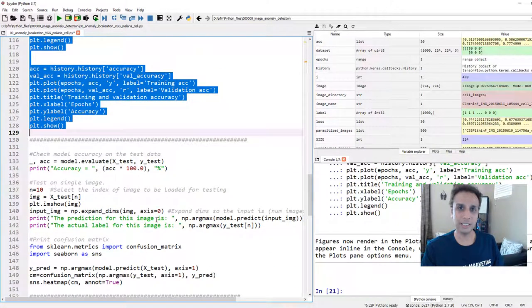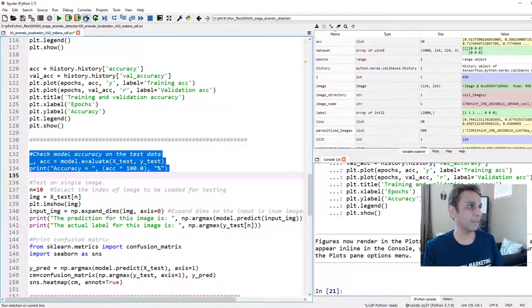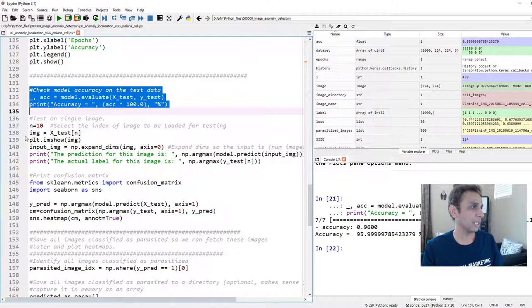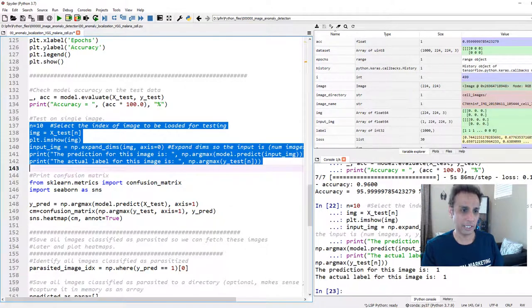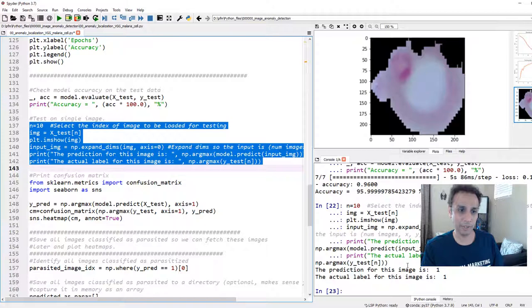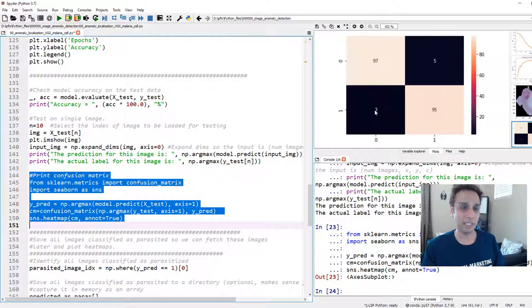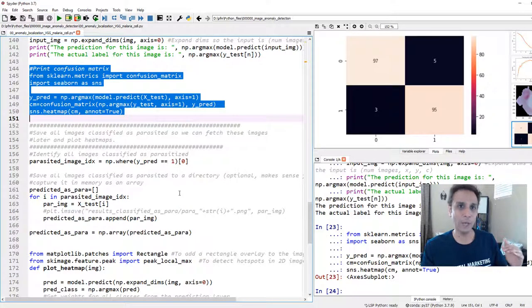So far we haven't done anything new other than the global average pooling layer — if you replaced it with a flatten layer this would just be standard binary or multi-class classification. Let's check the accuracy for completeness — it's about 96%. We load a random image to sanity check: prediction is 1, and yes, that's a parasitic image. Then we look at the confusion matrix: 97 and 95 correct, with only 3 and 5 misclassifications. Excellent — I'm super happy with this model.